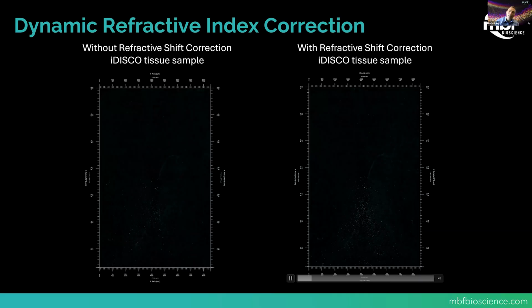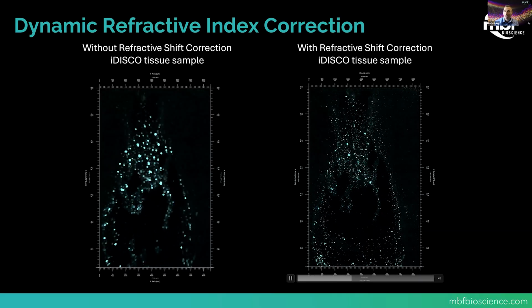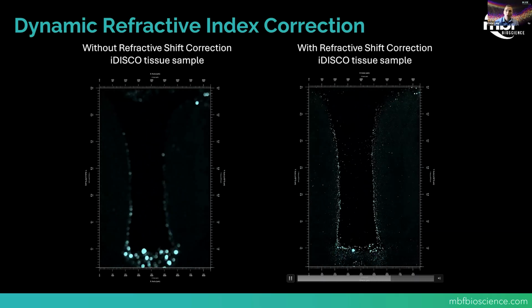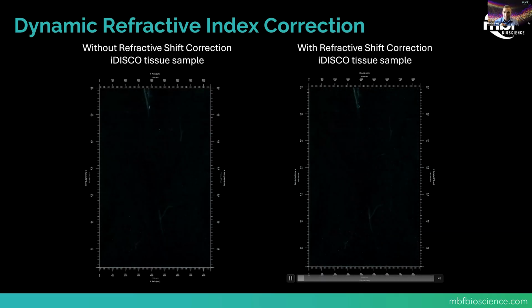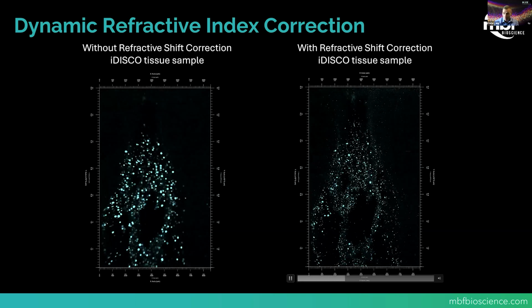And again, this is done in real time. This is not a post-processing technique. This is an optical correction that is enabled during the acquisition itself. Okay.